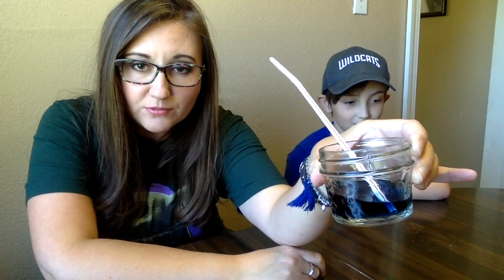So super cool. Okay, one last little demonstration, and Liam is here to help me. Say hello. Hello. He's going to help me prove that we breathe out carbon dioxide. Okay, so we're going to use that same chemical indicator, bromothymol blue, that I used in the last little lab. And what he's going to do is he's going to use this straw to blow air into this little jar that's full of that blue pH indicator, bromothymol blue, okay?